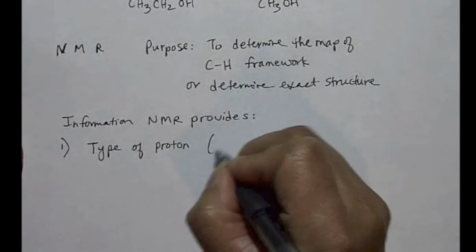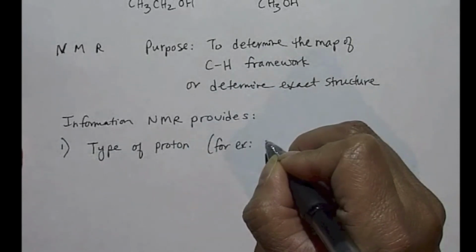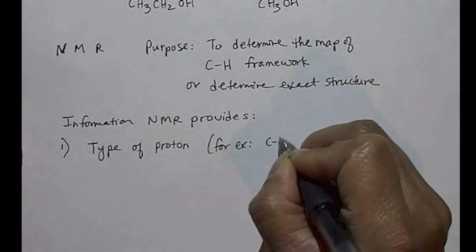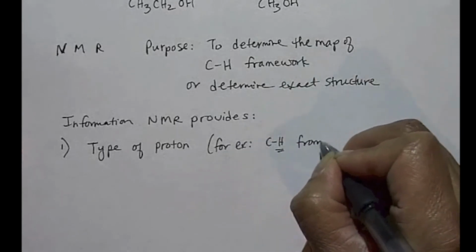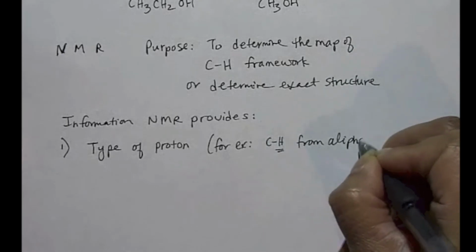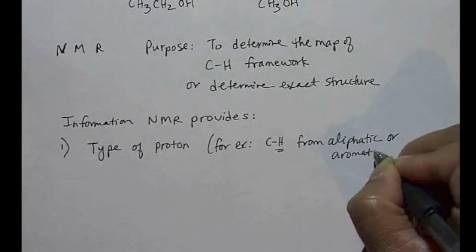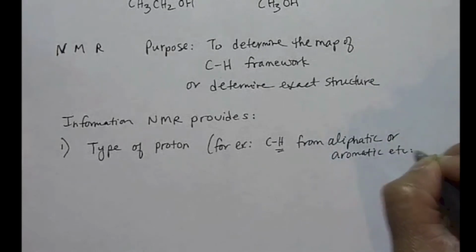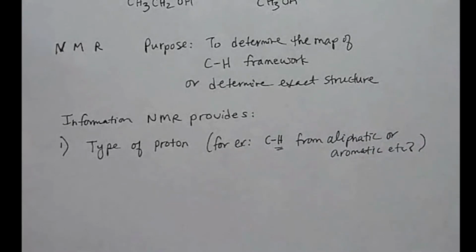For example, is the proton you're looking at from an aliphatic or aromatic, or is it an alkene proton or an alkyne proton?